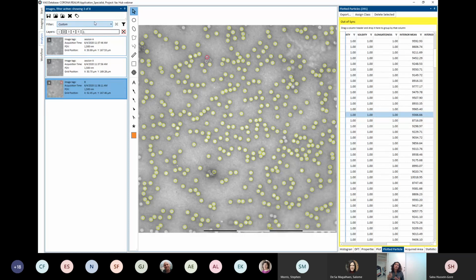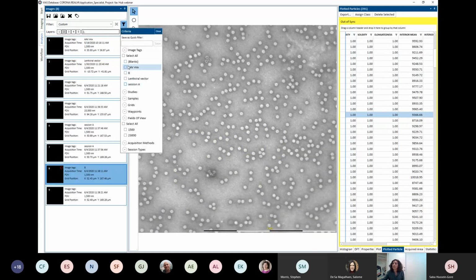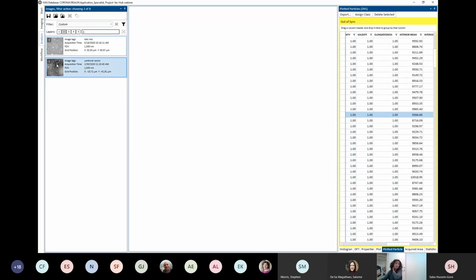But looking at this, I think CNN doesn't feel as valuable as it could be, but it really is for us, because when we look at pleomorphic particles, giving it clear instructions on the size and the description of the particles that we look at is a lot more difficult. And that's why I wanted to show you, to kind of finish up with 2 things. So I want to show you this one.